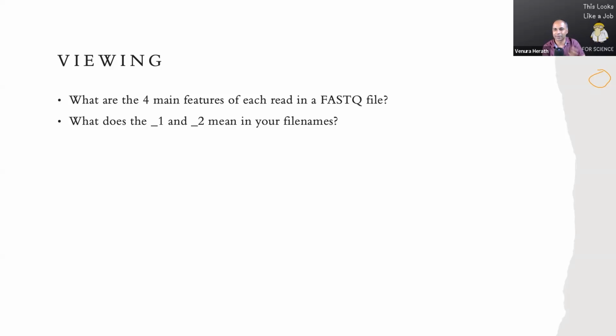And then to give you an answer for the first question. Remember the first one. It's basically some name to recognize the sequence and what sequence it used. Likewise, it can be a little long text. And then the second row we have the nucleotide sequence. And then third one, you have a plus.